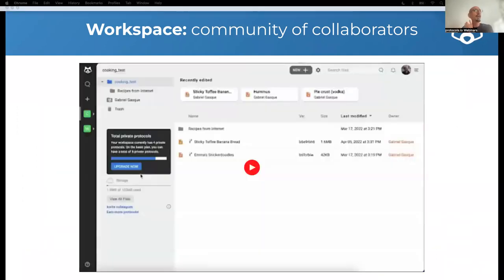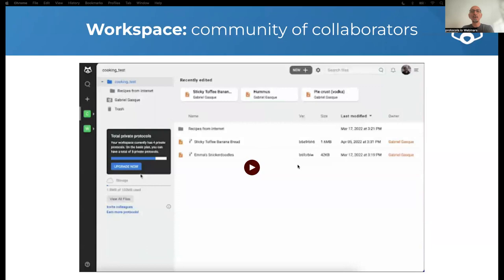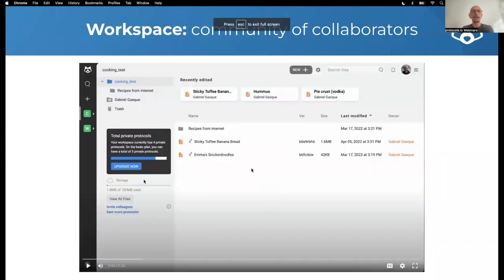To invite collaborators, you go to the, let me see if I can play this. Yes, sorry. So to invite collaborators, you can go to the administration menu. Oh, it's taking a bit to play the movie. But I'm sorry about that.